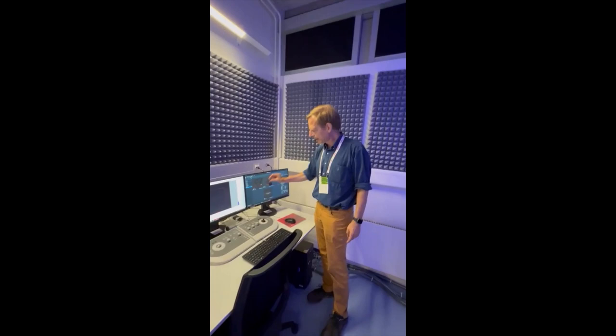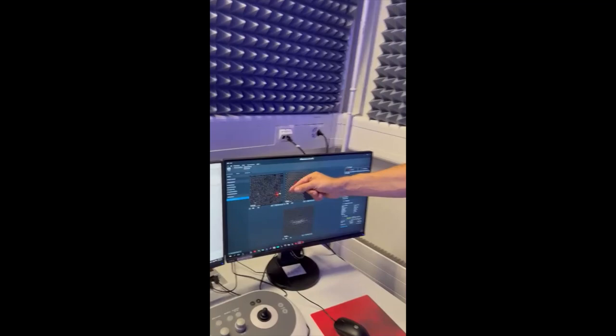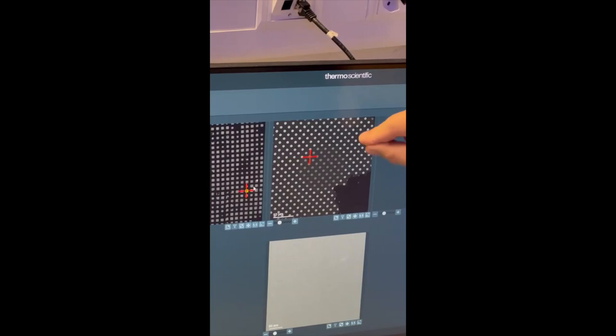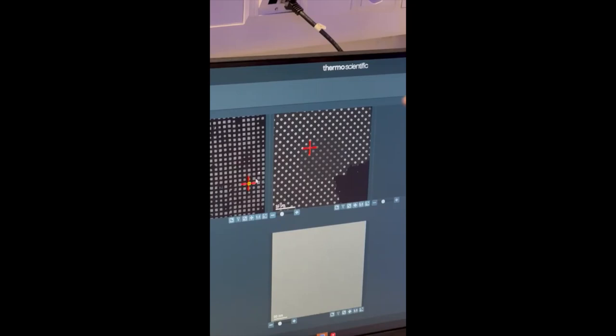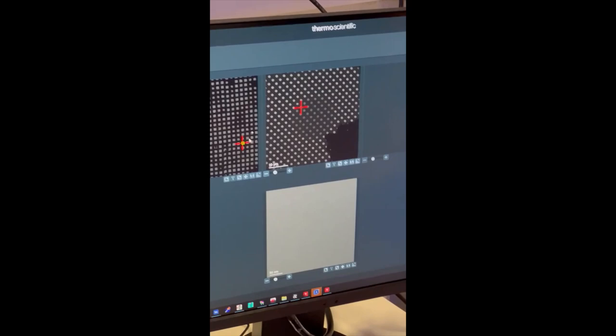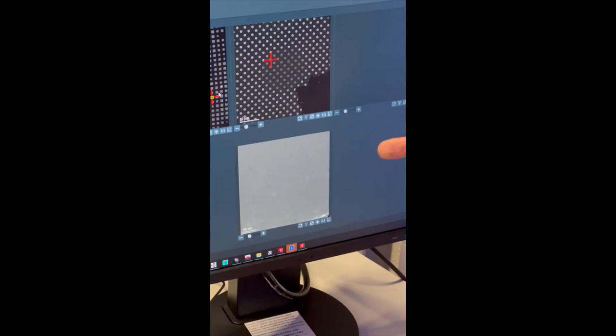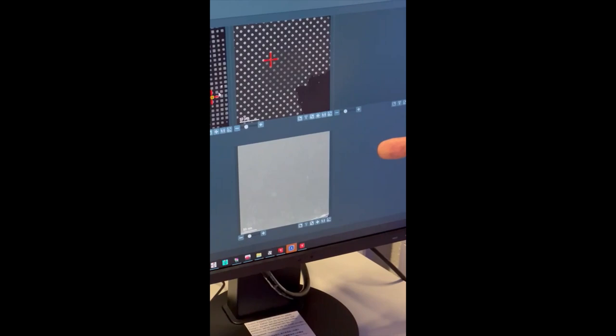It's a three-millimeter large grid, and in this grid the microscope focuses on a little square. In that square is a carbon film that has round holes, and then the microscope goes to each round hole and takes a picture. It just goes shoot, shoot, shoot, shoot. Each time it has to move the sample in the middle of the microscope, then focus correctly, and then take a picture. The pictures look like this—at the moment you don't see anything. You need to do computer image processing to take 10,000 such pictures and out of that make a high-resolution structure of a protein.